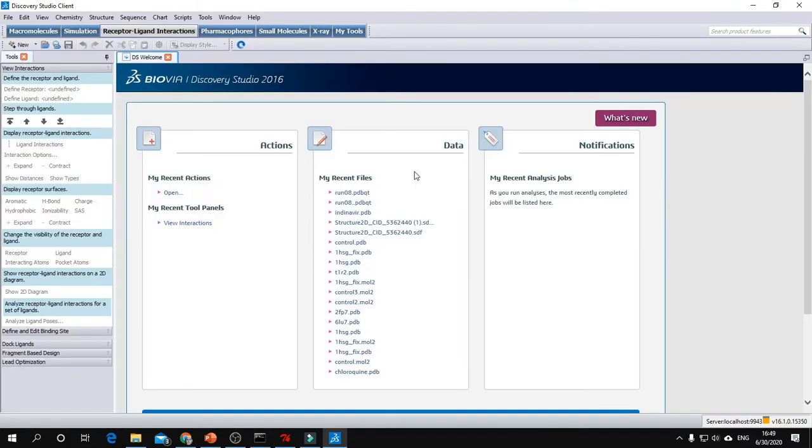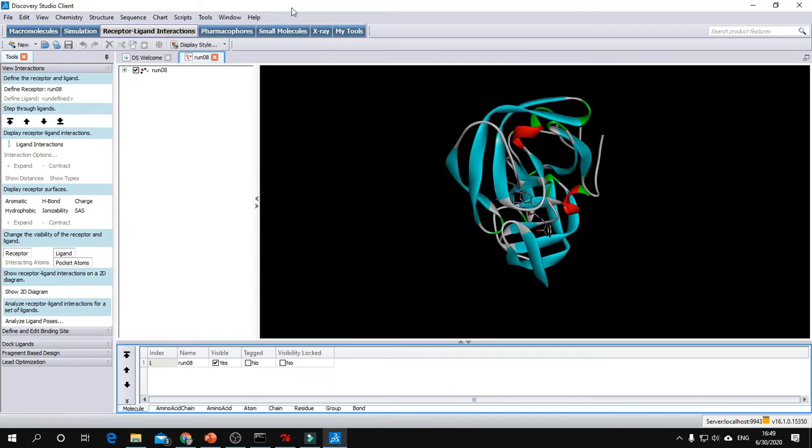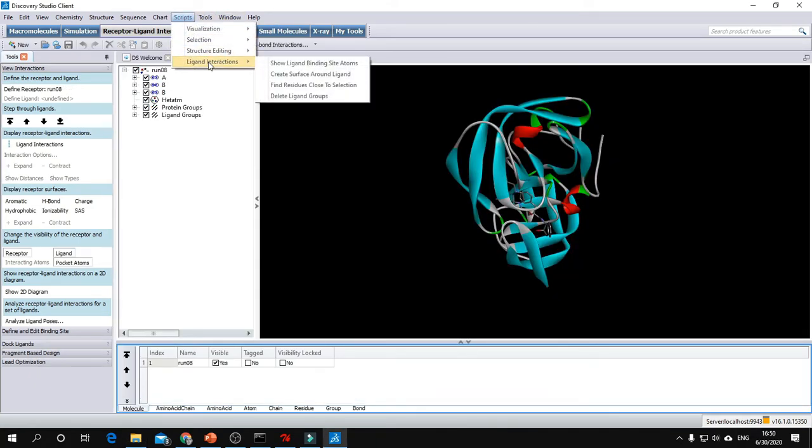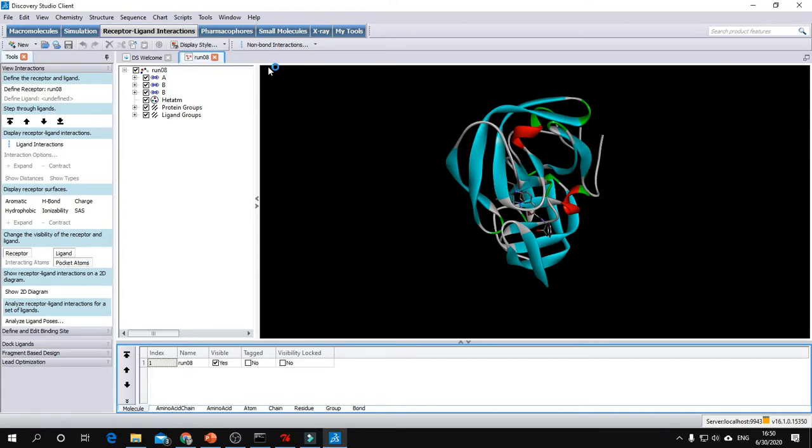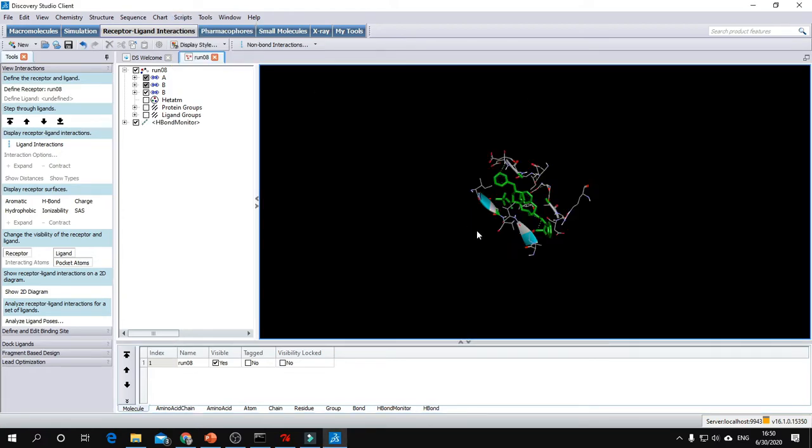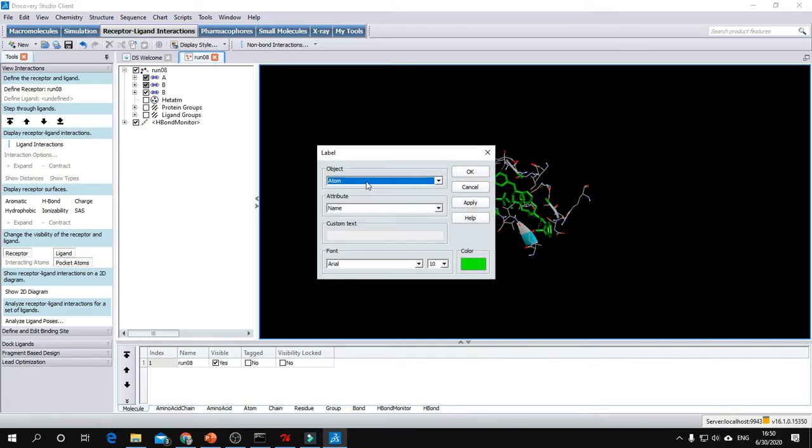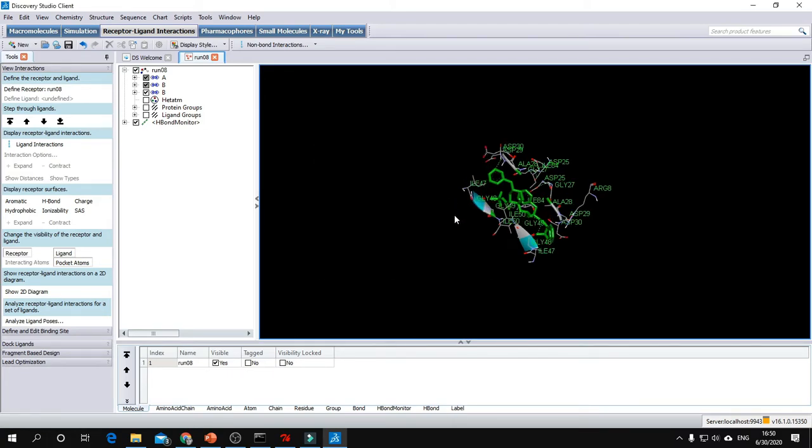After saving the PDBQT file of the conformation, open it using Discovery Studio. Go to Scripts, Ligand Interactions, Show Ligand Binding Site Atoms. This will show you the surrounding amino acids that have interacted with your small molecule. To label these amino acids, go to Structure, Labels, Add, choose Amino Acid, then OK.